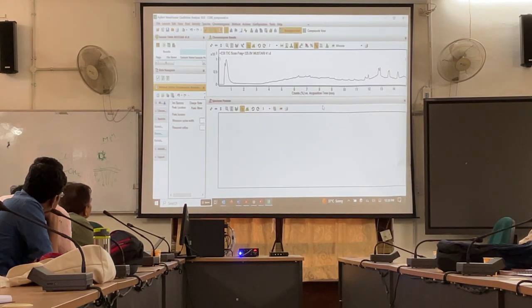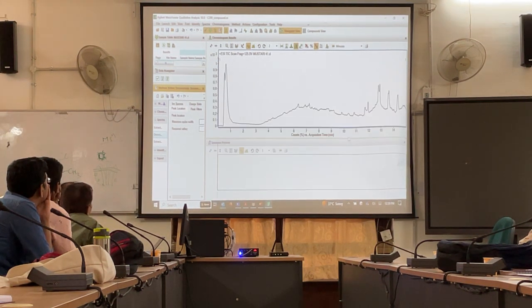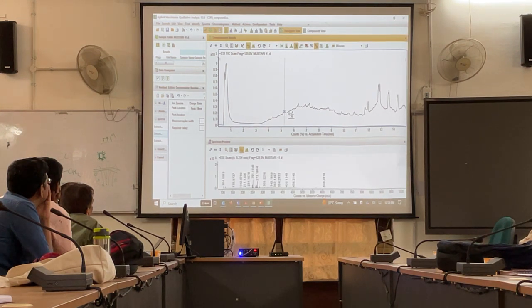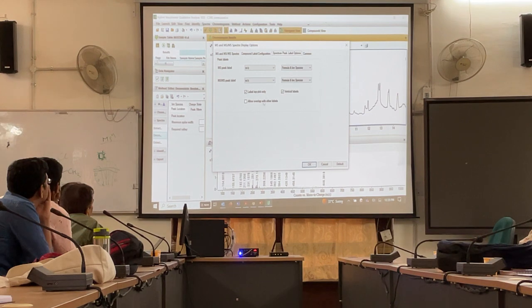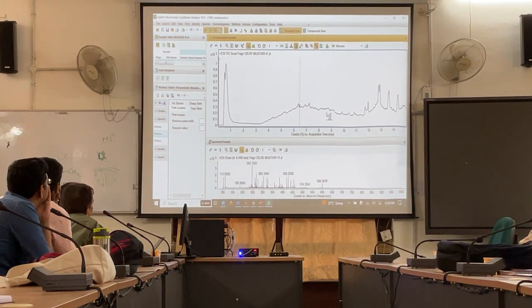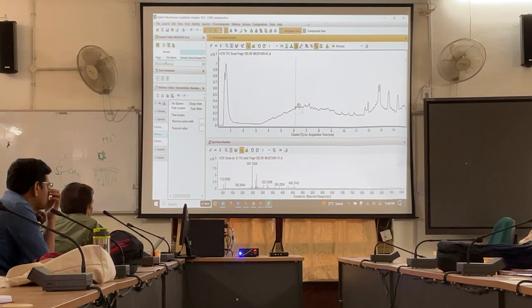First of all, this is how the data looks. We will see this data in the lab also. This is a typical HRMS run. If you select this tool, you will walk the chromatogram. You click anywhere and you will know what the peaks are which are coming here. All these are HRMS peaks. Multiple peaks will be coming at each point of time, and you can see this.